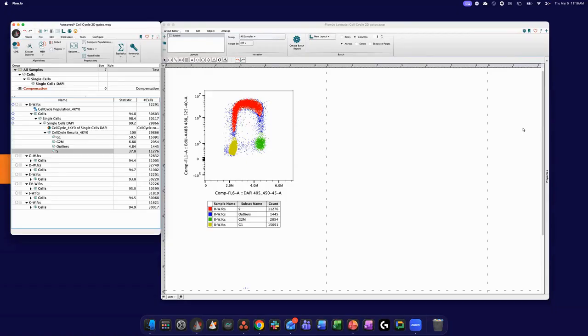Okay. I will remind that the plugin is only compatible for ARM Mac and for Windows. So if you are on an Intel-based Mac, I don't believe the tool will work. Okay. All right, so that's pretty much it. And then I could take this node, drag and drop it to the rest of the group, which I won't do because it's going to take several minutes to calculate for everything. But it would be very similar to what we did for the 1D analysis.